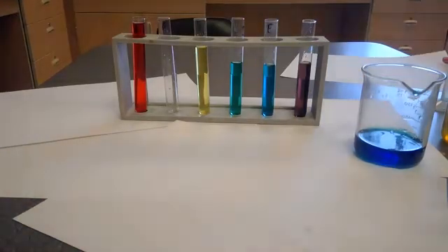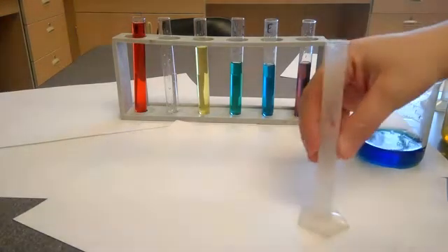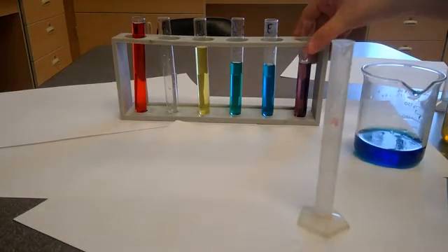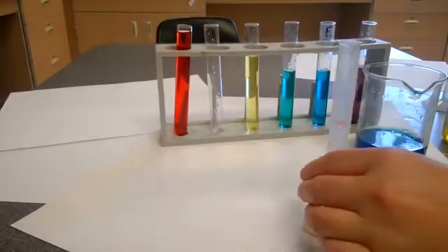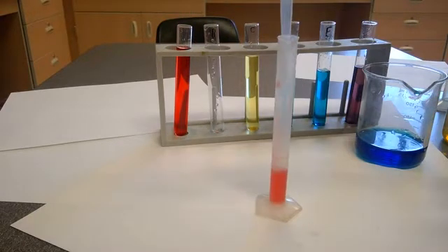All right, so next I'm going on. Now I'm on step number 9. Step number 9 says I have to take from test tube A. So A is extremely full of red, so I'm going to take 8 milliliters of water out of there. So here's the best measuring tool for that. And I'm just going to move this a little bit closer so that I don't have to reach quite as far. And again, 8 milliliters.